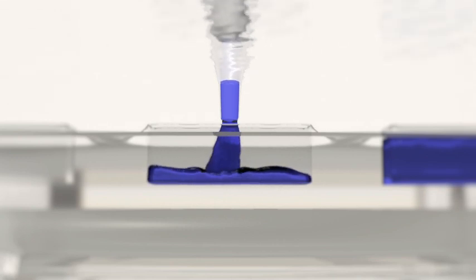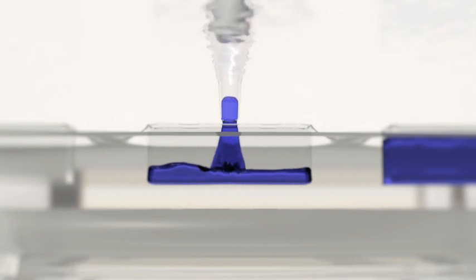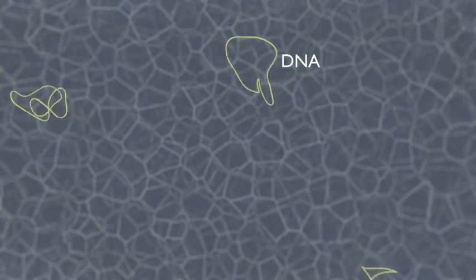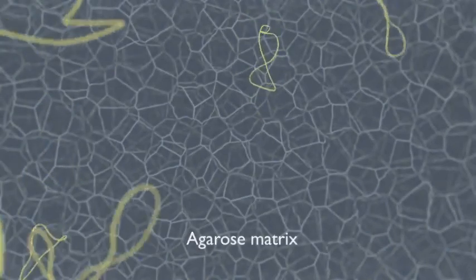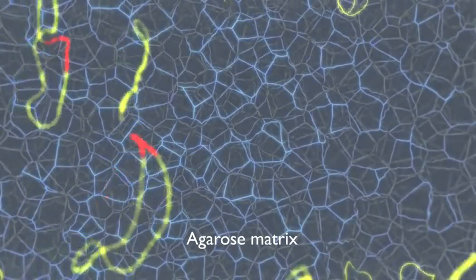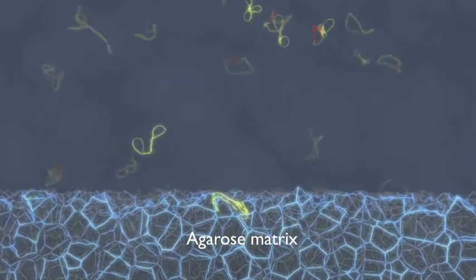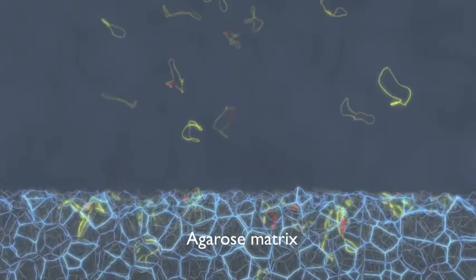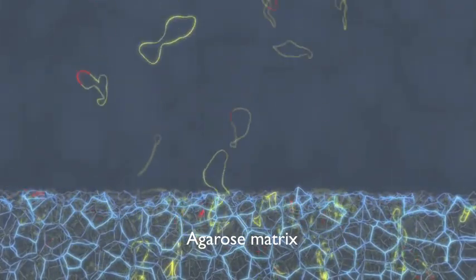The dyes help researchers track the progress of the DNA fragments as they migrate through the gel. When electrical current is applied to the gel, the DNA fragments, which have a negative charge, migrate through the gel from the negative electrode toward the positive.